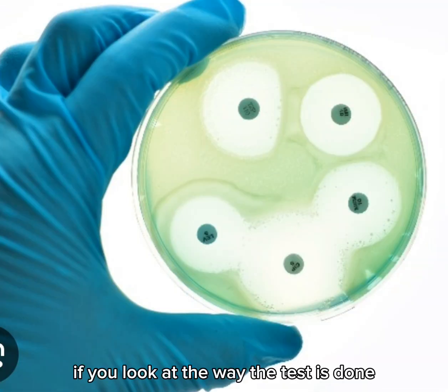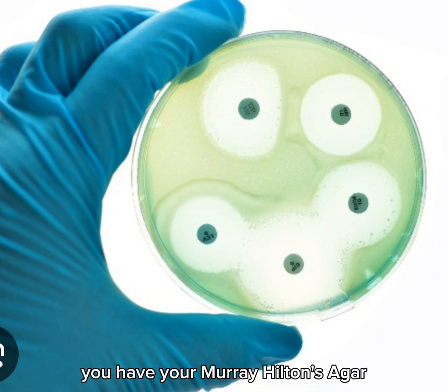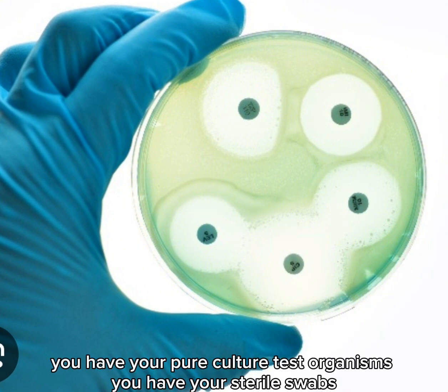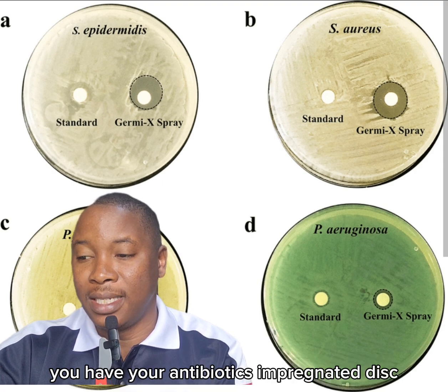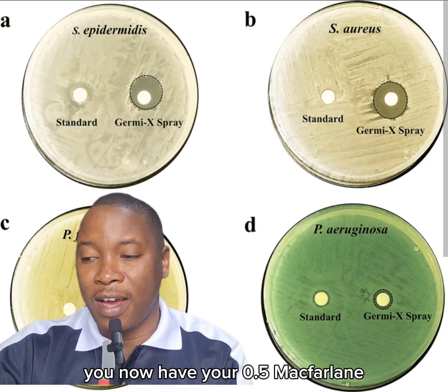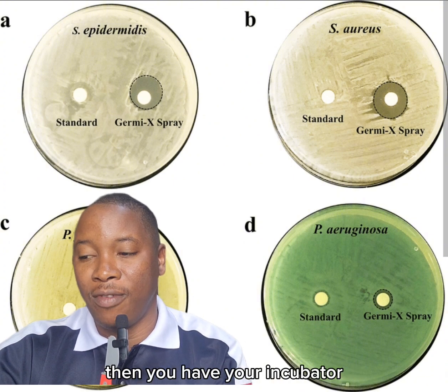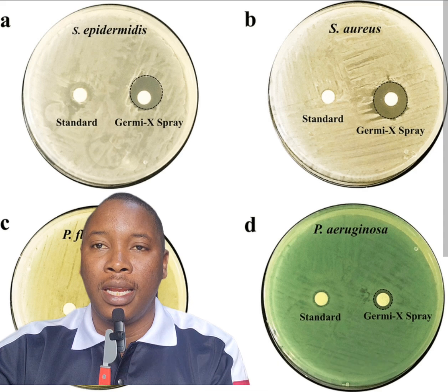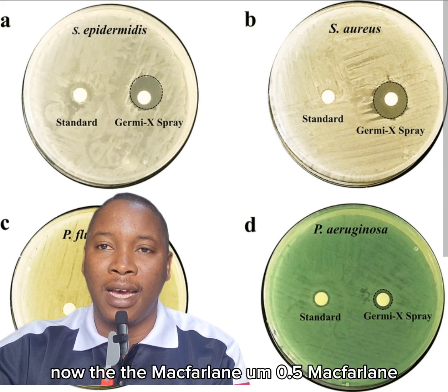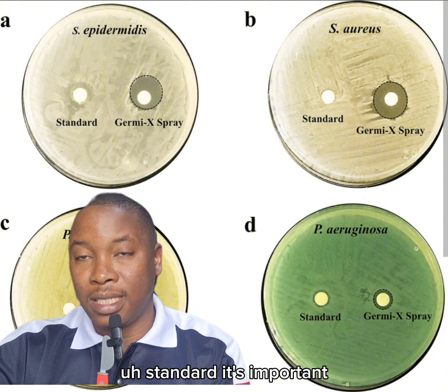So these are important parameters that we use, and like I said before, if you look at the way the test is done, you have your Mueller-Hinton agar, you have your pure culture test organisms, you have your sterile swabs, you have your antibiotic-impregnated discs. You now have your 0.5 McFarland standard for inoculum adjustment. Then you have your incubator, and then you have your ruler or calipers for measuring.